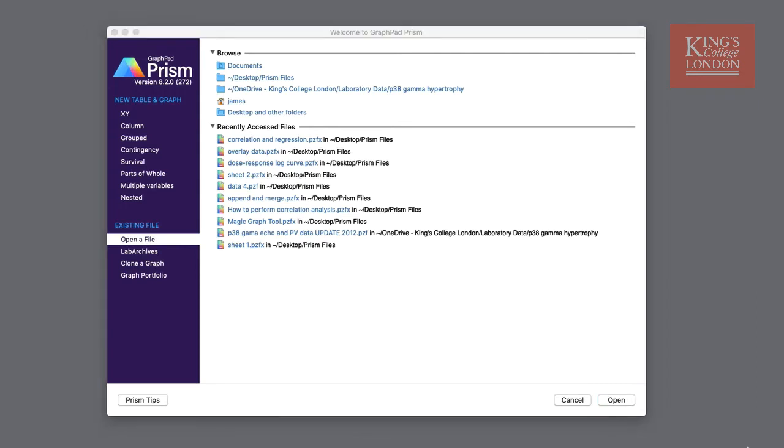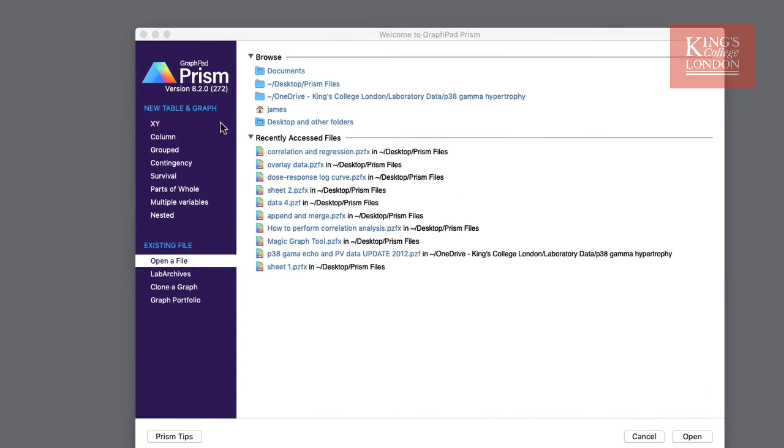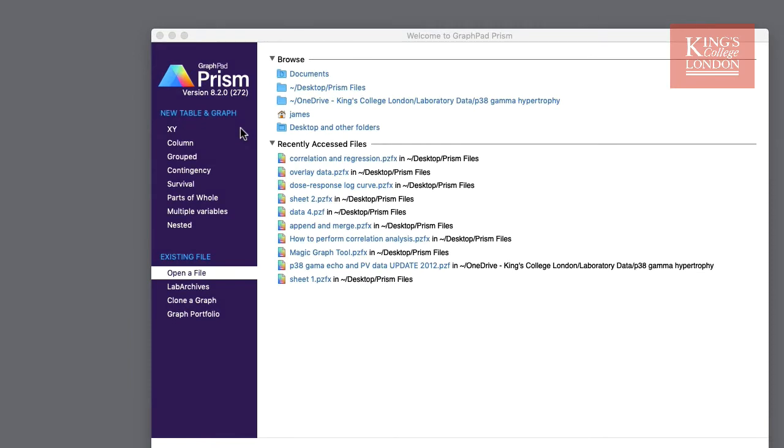But let's start with creating a new graph. In the new table and graphs option there are eight tables and graphs that you can create. These are XY, Column, Grouped, Contingency, Survival, Parts of Whole, Multiple Variables and Nested.